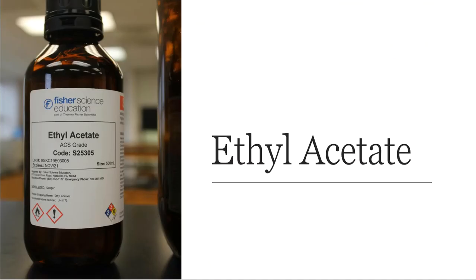So here's the picture of ethyl acetate that we used in our lab. Ethyl acetate also comes from Fisher Science Education, and the lot number you can see on that label as well, 9GKC19E03008. So ethyl acetate is going to go into its own tank, and then ethyl acetate is also going to be mixed in with the hexane to make a 50-50 mix that will go in its own tank as well.